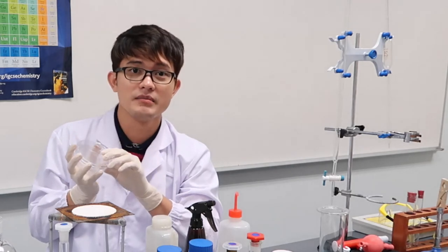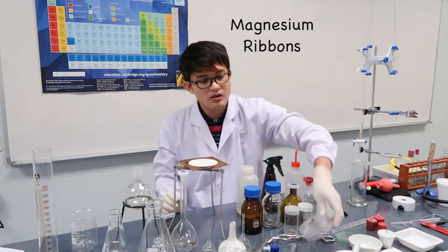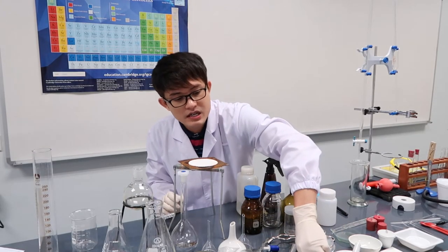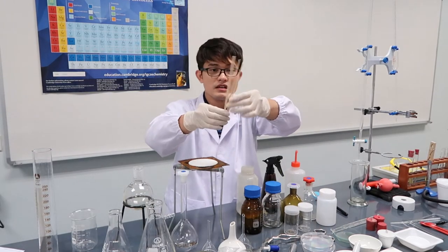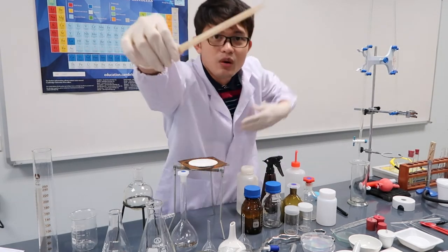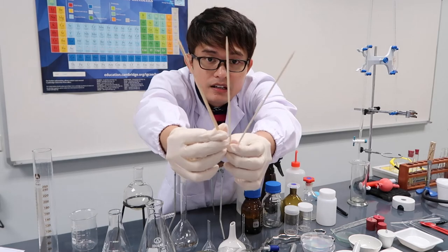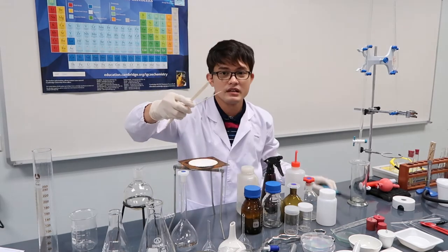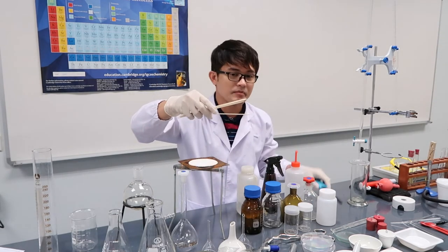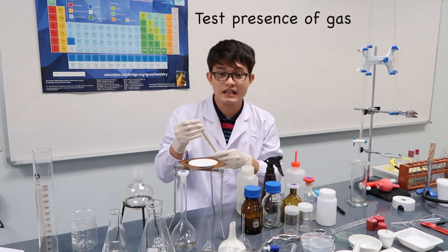These are what you might call barbecue sticks or, here in Singapore, satay sticks — but in chemistry, this is called a wooden splint. You light it with fire and then test for the presence of gas in test tubes.